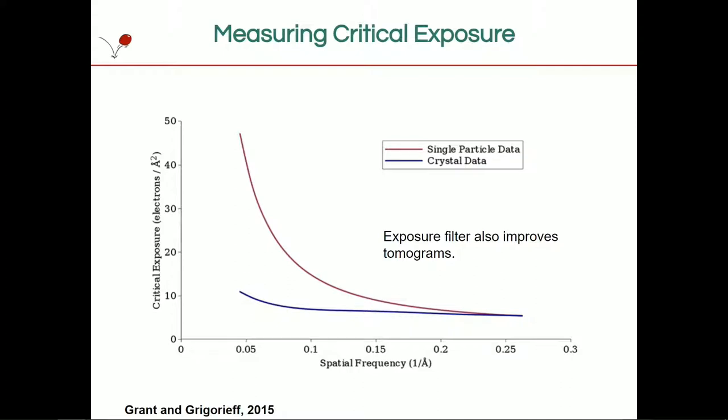This is presumably to do with crystalline order. If you break the crystal up in various parts, that becomes important for the crystalline diffraction spots, whereas the single particles don't really care about what's happening between them. But still, it's not entirely clear, actually.